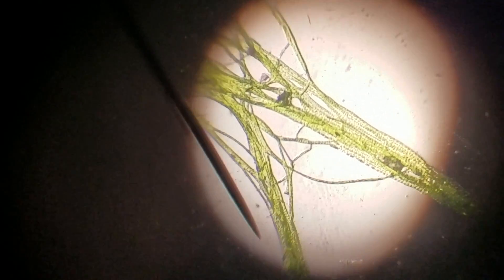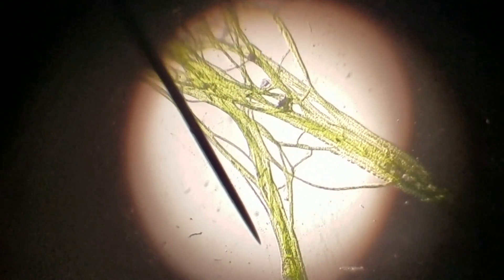I had thought this would probably be stray algae in the driveway, but it is cyanobacteria for sure. It looked furry even though it was slimy, and when you see these individual filaments you know it is a filamentous cyanobacteria — meaning it has filaments, like the little lines that glow in a light bulb.